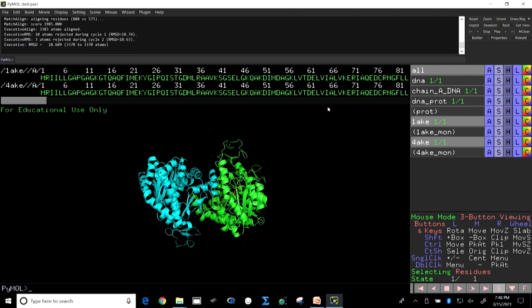You should always remember, this is one of the most fundamental lessons when using molecular visualization or dealing with structure. You never align two structures in their oligomer. Whenever you need to align or compare two structures, you always make monomers out of them. Arey, we already made monomers. So, let us see what will happen if we take the monomers.